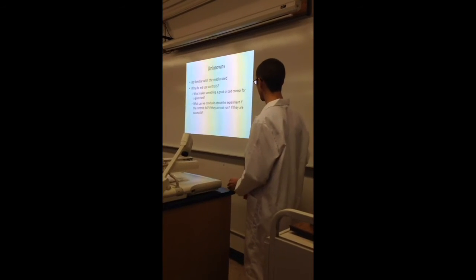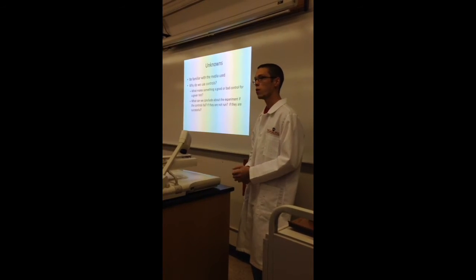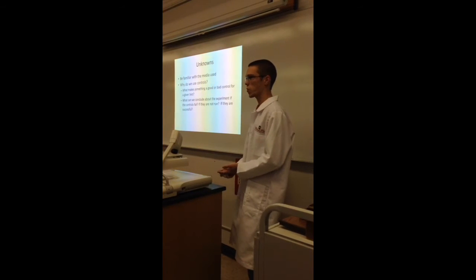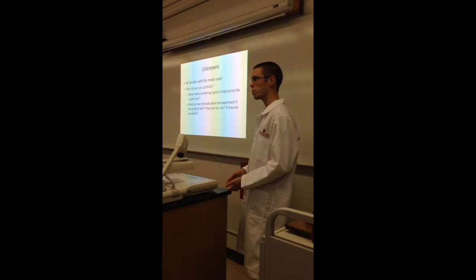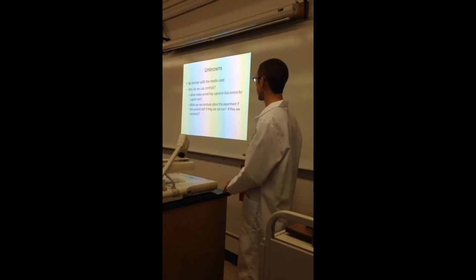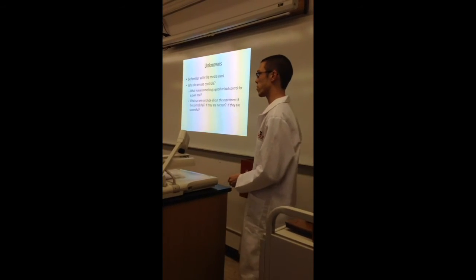And then for the use of controls, what can we conclude about an experiment if the controls fail? And this is just rhetorical again. What if they're not run? Is the experiment valid? Do you need to redo it? Or if the controls fail, do you need to redo the experiment? And if the controls are successful, then what can you conclude about your results? So the unknown questions are going to be focused on the importance of controls and their utilization.